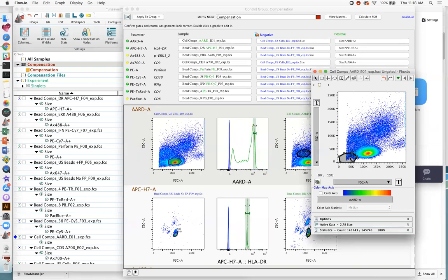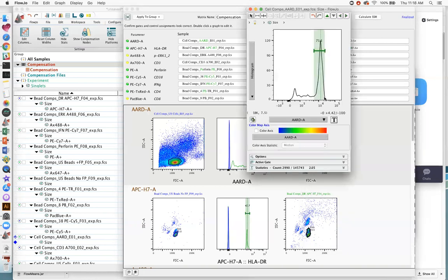If you go in the bottom corner here, this is where you're going to have a lot of debris as well. You see some positivity. I'm going to go ahead and move this gate in that location. Okay, I'll leave the gate where it's at. Maybe trim this ranged gate to make sure that I get the positive taper at the end there. Just extend that a little bit.